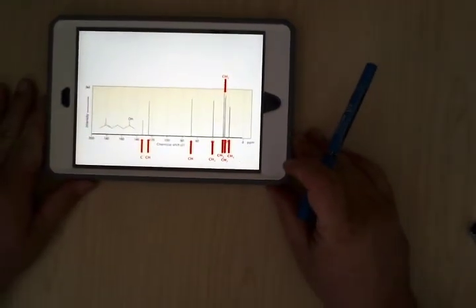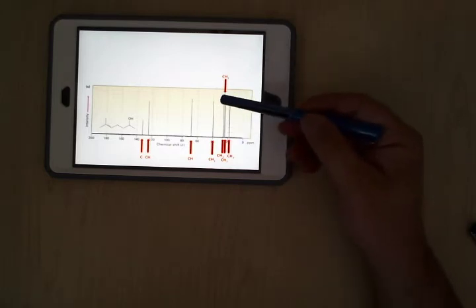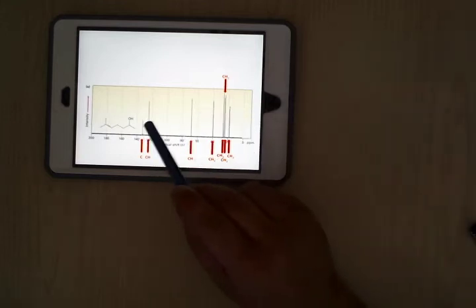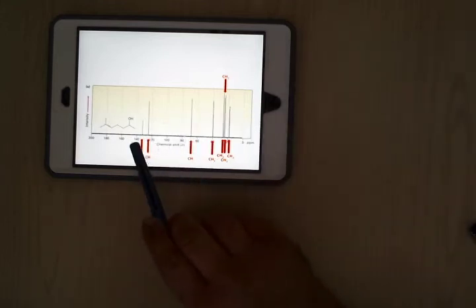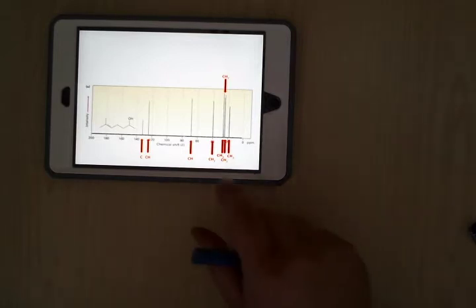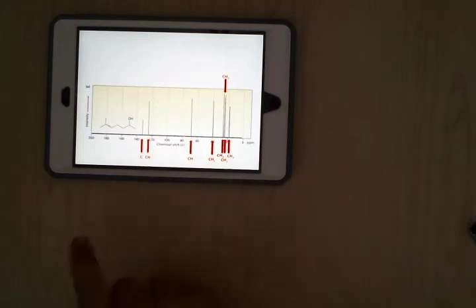Okay, so there's CH3 sort of in the middle, or CH2 in the middle there. CH2, CH3, CH3, CH3. Right, this CH2 is here because those were negative. These two showed up in the DEPT 90. This one didn't show up in any of them. So that's how we know. And if we put these together and combine it with the chemical shift data, we can work it out.